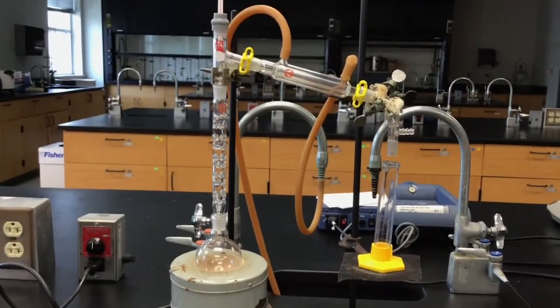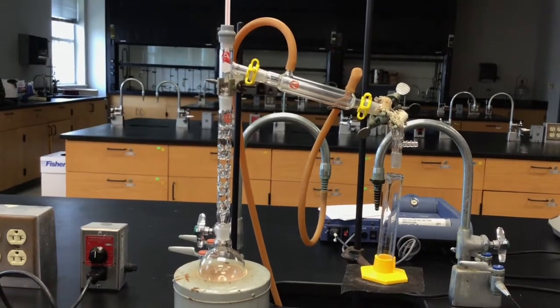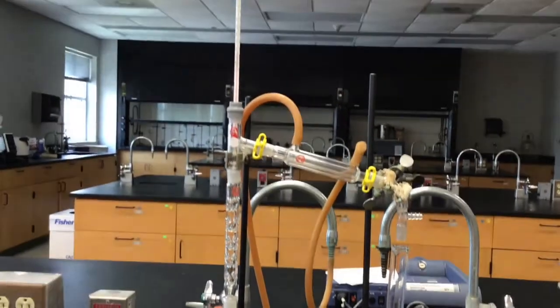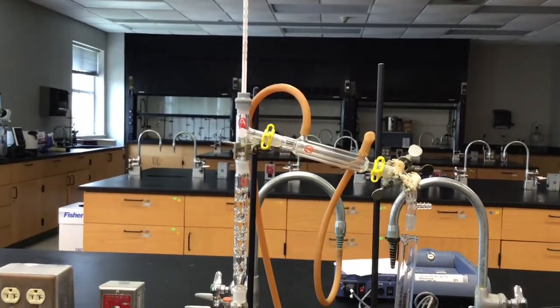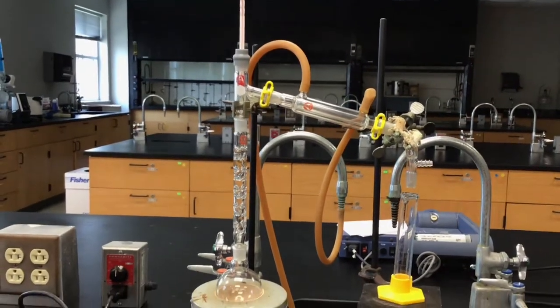As you perform the distillation, you need to keep an eye on your temperature because this is important. About every five milliliters or so, including when you start at the beginning, you need to take the temperature of the apparatus using the thermometer at the top.